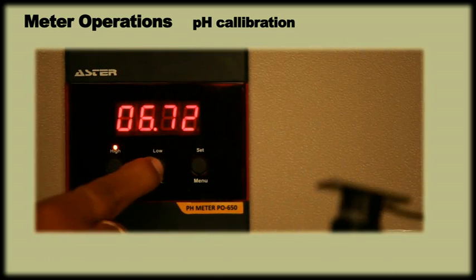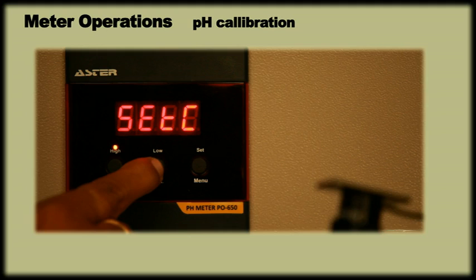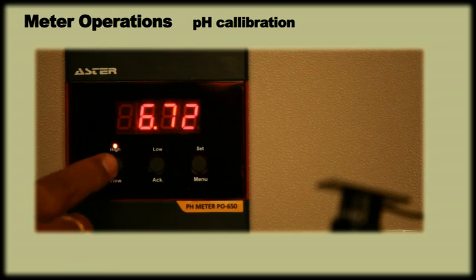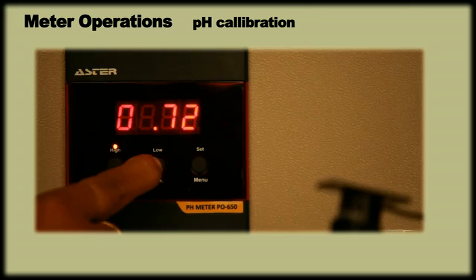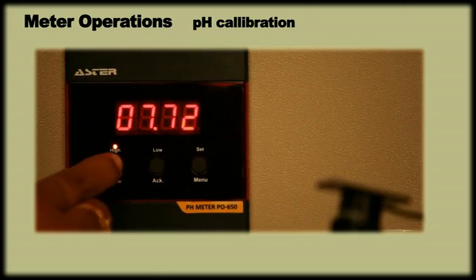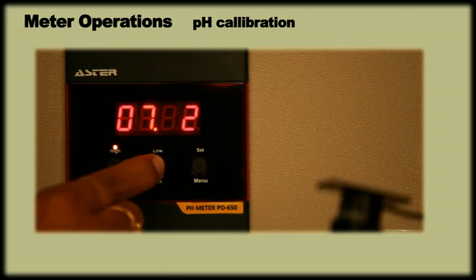Now dip the sensor in 7 pH solution and wait till the reading stabilizes. Press ACK key to select SATC to set the 0 value. Then display will show a reading with its first digit blinking. Set this value to 7.00 using view and ACK key and press menu to enter.